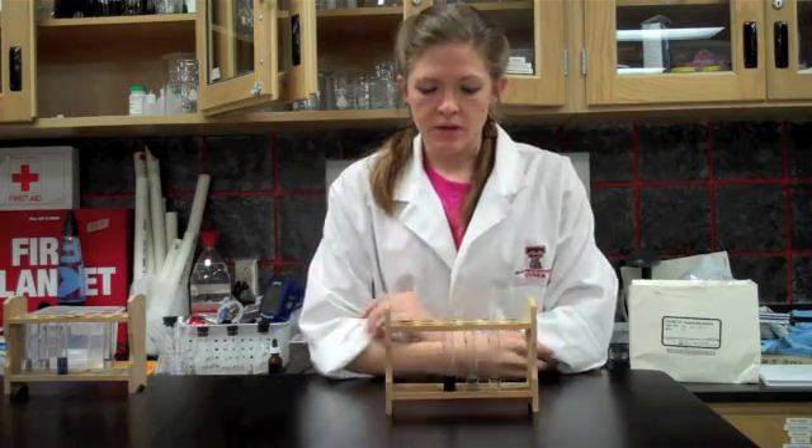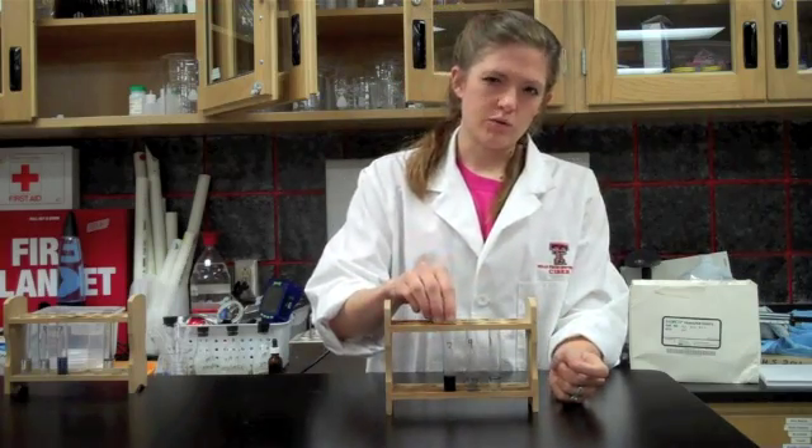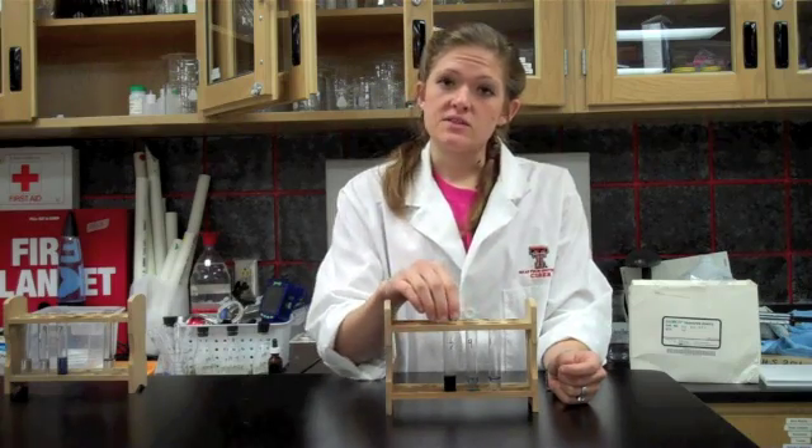Here's what the colors mean. In each of these solutions originally, you had starch, and when you add iodine to starch, it turns bright blue, or kind of a navy blue. So each solution started out as that dark blue color, which meant that it had starch in it.